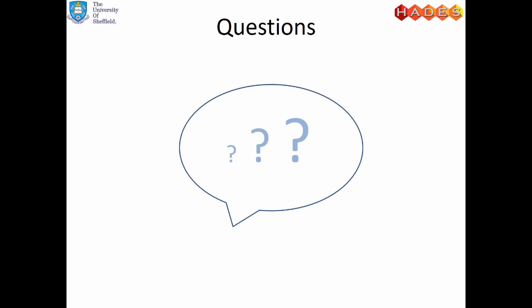Hi, Neil. Danny Vittetti here. I've got another question, if that's all right. Please. So in your mapping procedure, are you basically performing a linear combination fit on each step for the differences in the two spectra at those given energies to differentiate your U4 to U6 ratio?